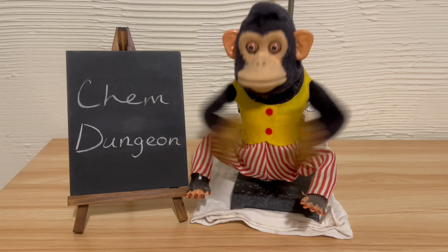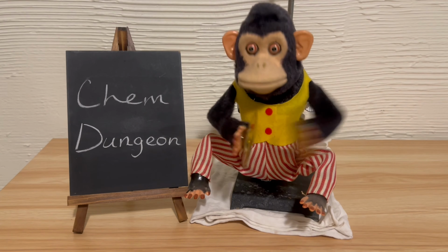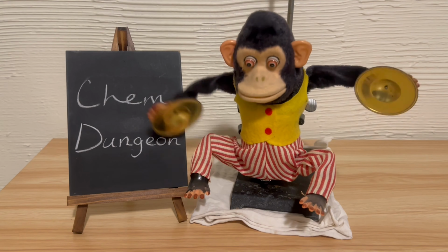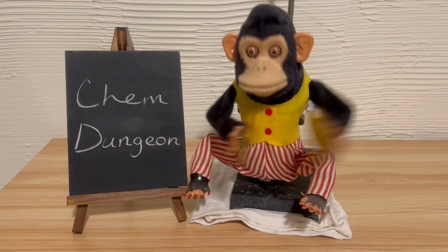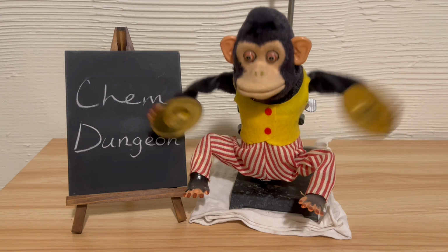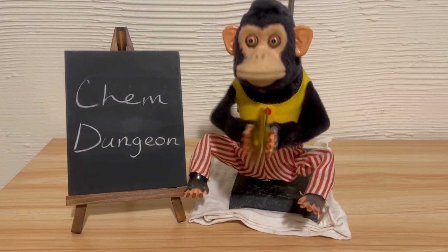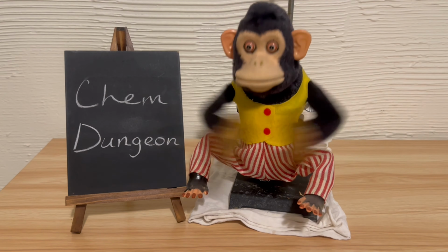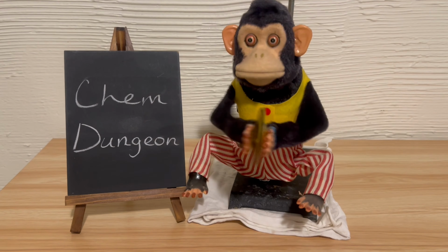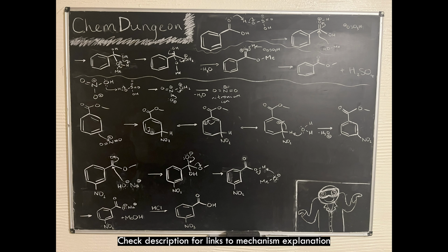I know that nitrobenzene can be made by the mixed acid nitration of benzene, which is how I made it for the stuff that I used in scrap synthesis video, and left over from that synthesis is what I used in my last video. And benzene can be made by the decarboxylation of sodium benzoate by fusing it with sodium hydroxide in a paint can connected to a distillation setup, and the yield is usually about 70% from what I've seen, and about 80 to 85% for the nitration. So I'm curious about which is more efficient, and not having to work with a paint can setup is better than having to use it.